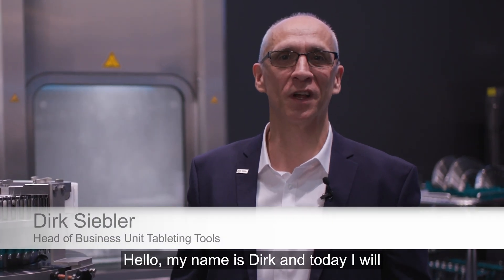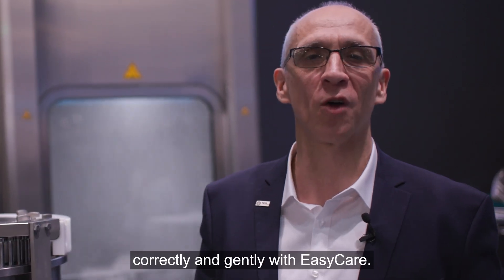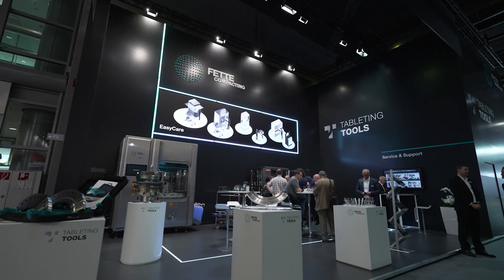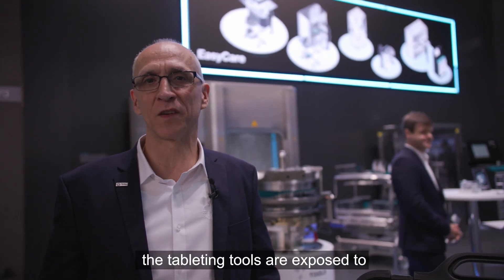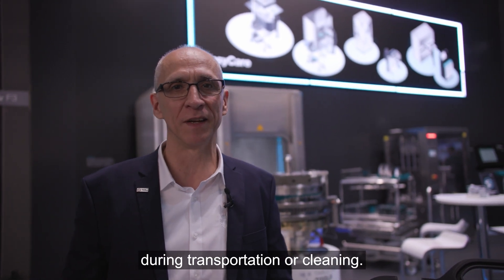Hello, my name is Dirk and today I will show you how easy it is to handle tableting tools correctly and gently with EasyCare. In daily tablet production, the tableting tools are exposed to the risk of being damaged during transportation or cleaning.